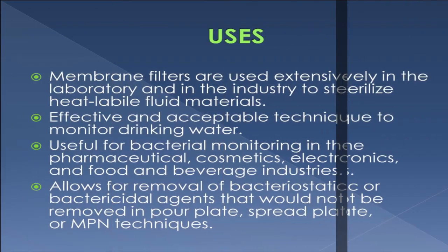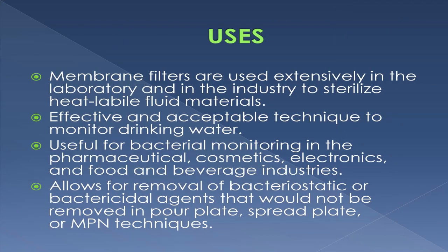Uses of membrane filter. Membrane filters are used extensively in the laboratory and in industry to sterilize heat-labile fluid materials. It is an effective and acceptable technique to monitor drinking water. It is also useful for bacterial monitoring in the pharmaceutical, cosmetic, electronics, and food and beverage industries. It allows for removal of bacteriostatic or bactericidal agents that would not be removed in pour plate, spread plate, or MPN technique.